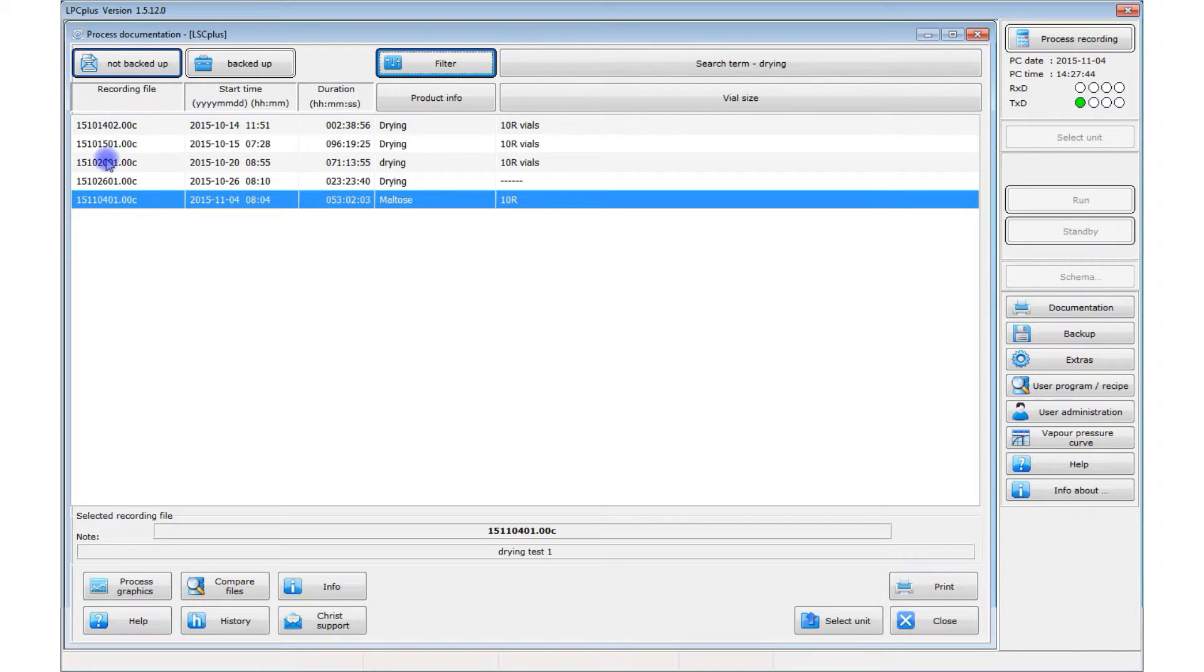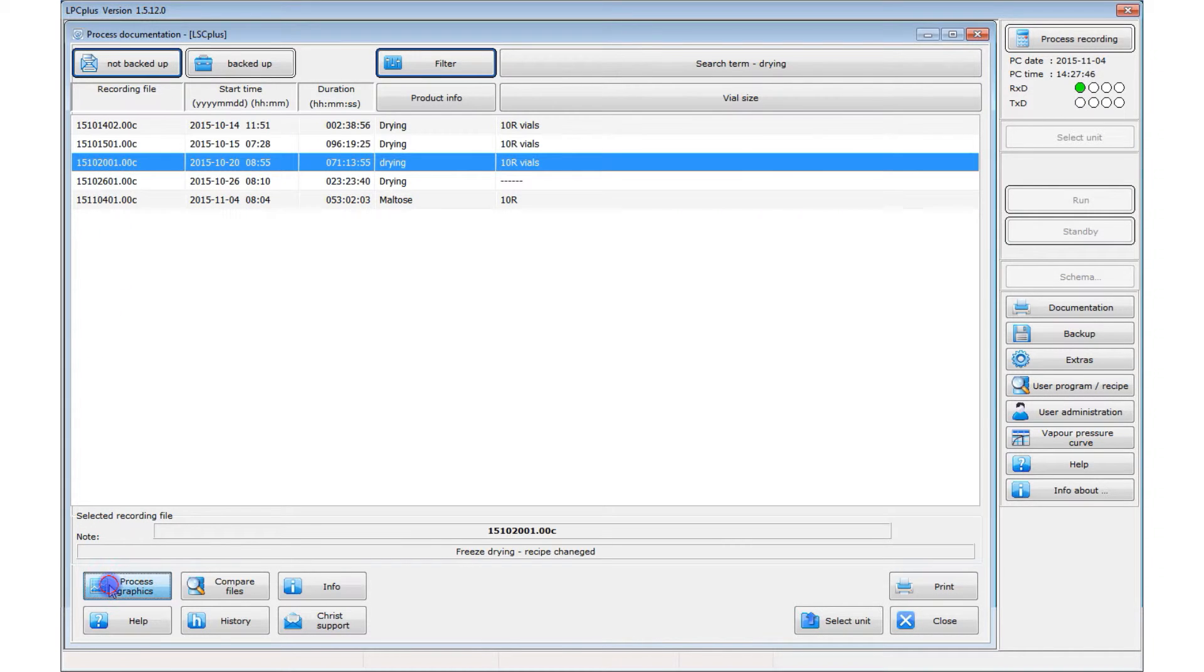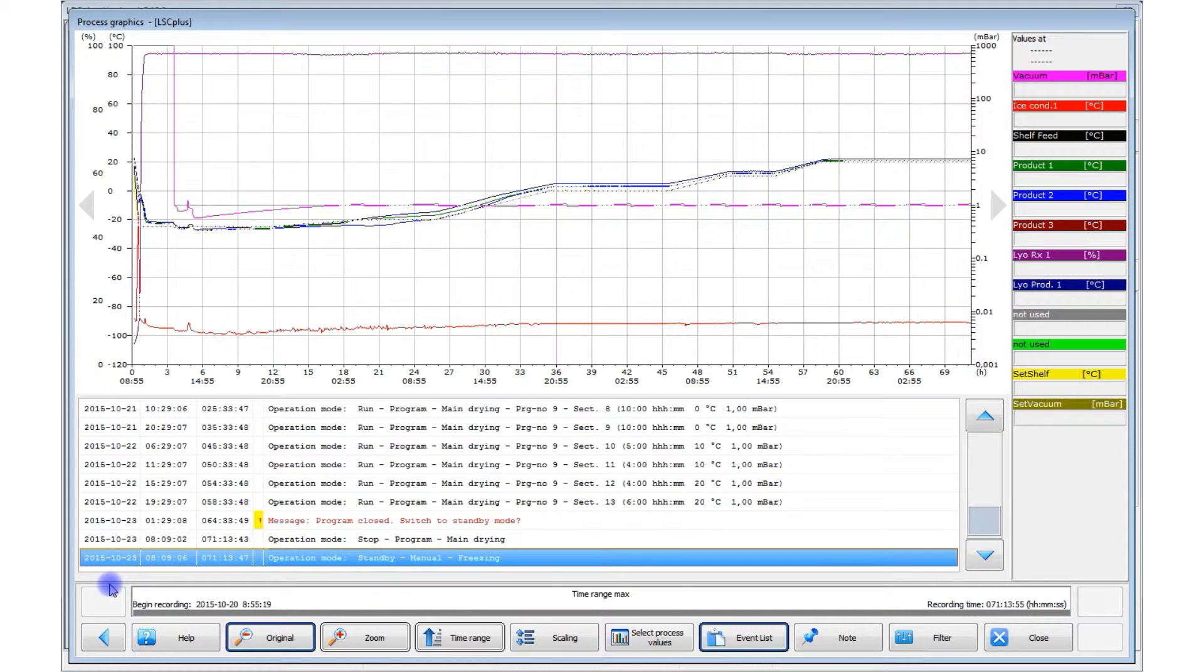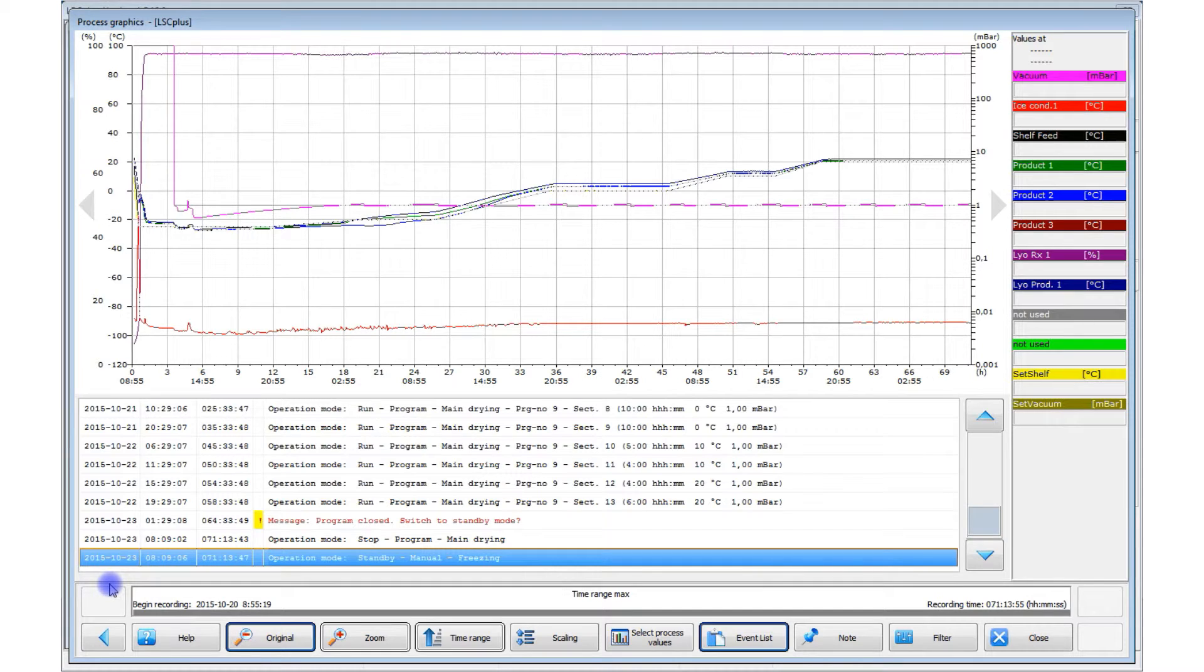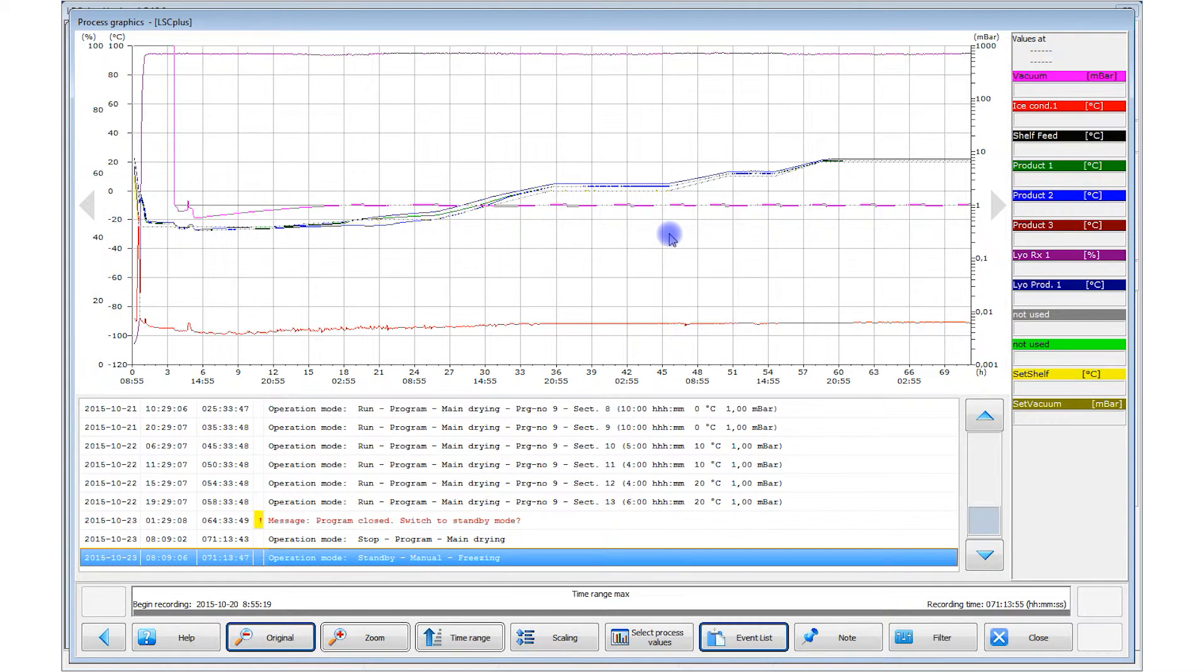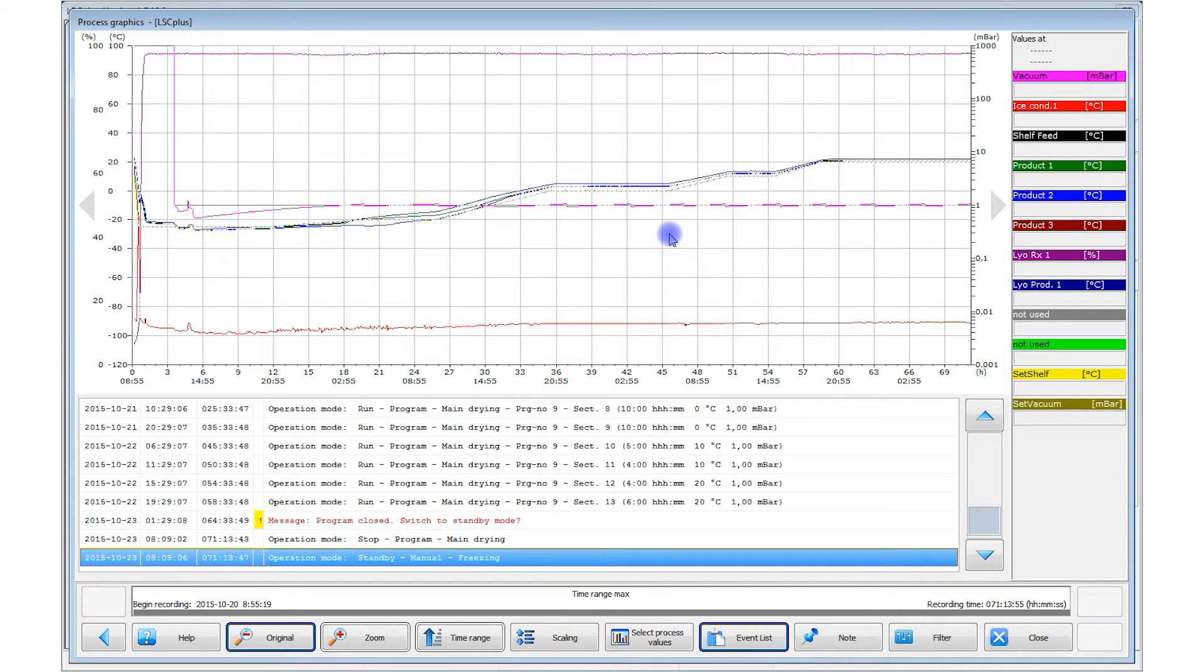You can use the filter function to search for specific processes based on the batch data stored in the record. A list of processes matching your search criteria is displayed. After you have selected a process, the process graphics and the associated process events list are displayed. Now you can analyze the process history in detail. For example, you can see when it switched to main drying mode. Also, any messages or alarms that were generated or pressure and temperature curves during the process can be found in the process events list.